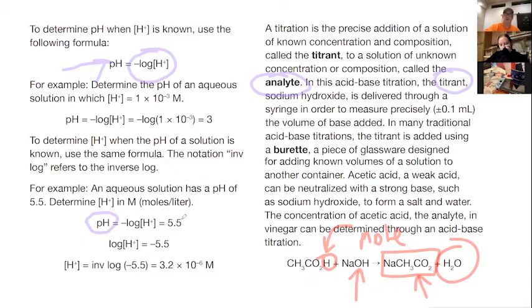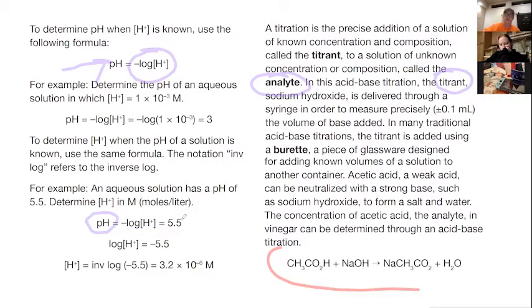This is the acid. This is the base. What's the molar ratio? One to one. 1 to 1, exactly.